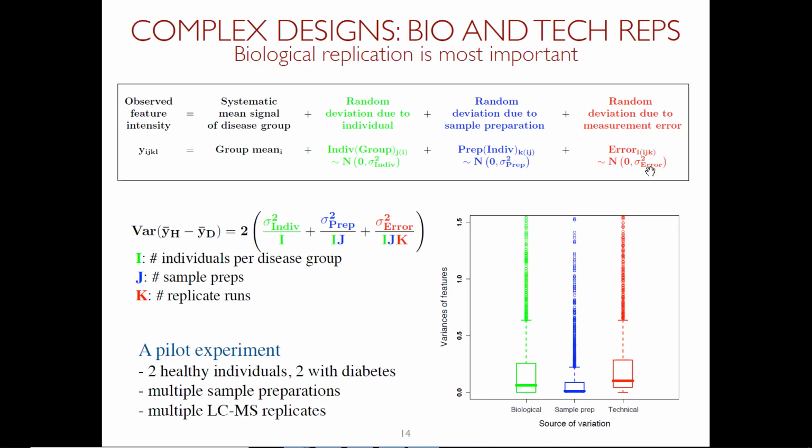So these models, and in fact this is exactly how we work with MSstats, these models are equivalent to averaging in some very narrow cases of balanced designs, no missing values. But what we can actually do with modern statistical technology is to work with that in unbalanced cases and missing values. So you really can expand.